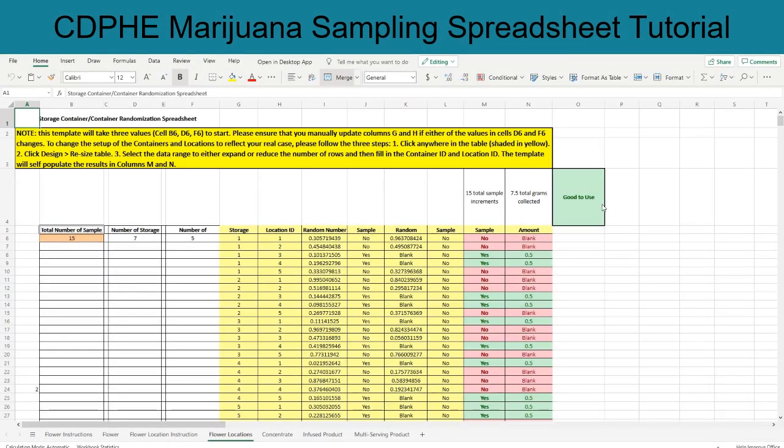Welcome to the CDPHE sampling spreadsheet instructional video. This short video will walk you through how to use the spreadsheet to collect sample increments for the purposes of creating a test batch in accordance with Colorado Marijuana Enforcement Division MED Rules 1 CCR 212-3 and the CDPHE sampling procedure. This spreadsheet is intended to be used in combination with the sampling instructions outlined in the applicable CDPHE sampling procedure.